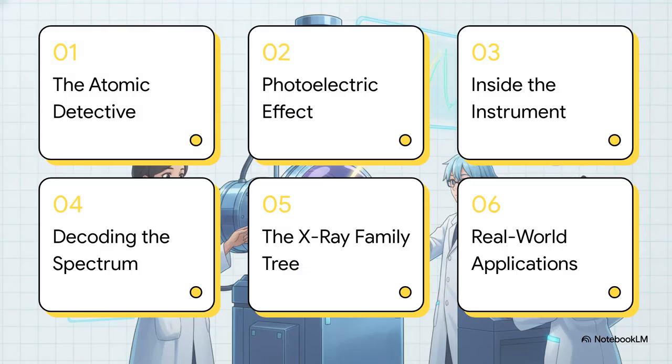Here's a quick look at our agenda for today. We've got 1. The atomic detective, 2. The photoelectric effect, 3. Inside the XPS instrument, 4. Decoding the spectrum, 5. The X-ray family tree, and 6. Real-world applications. All right, let's jump right in.